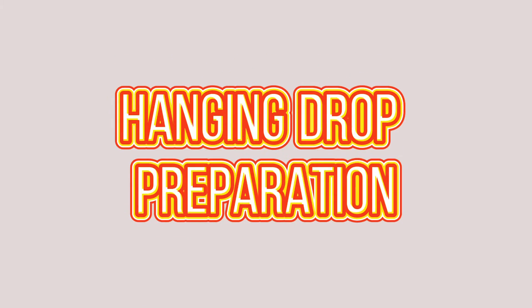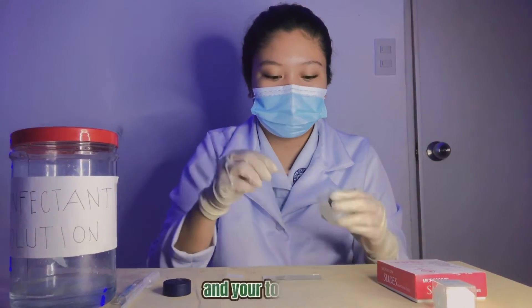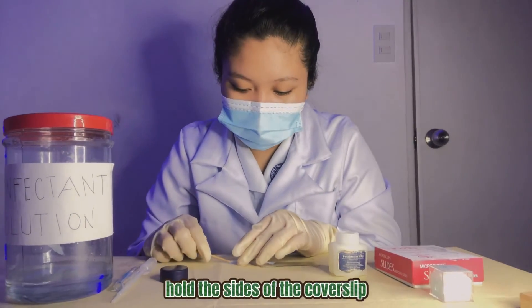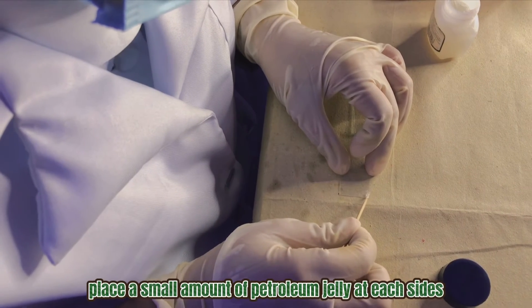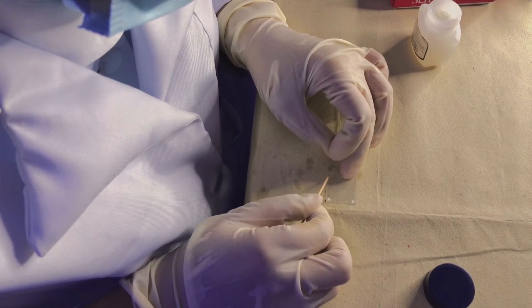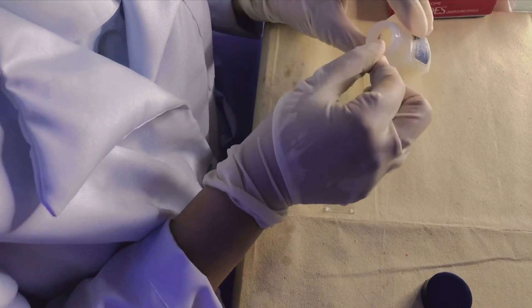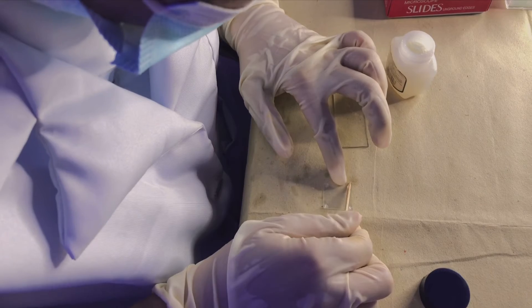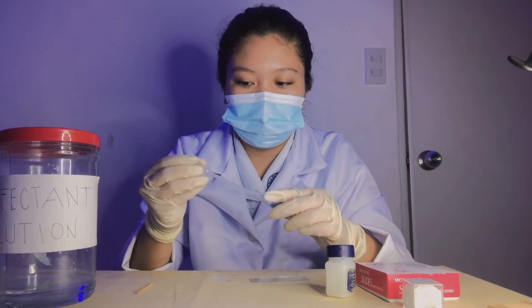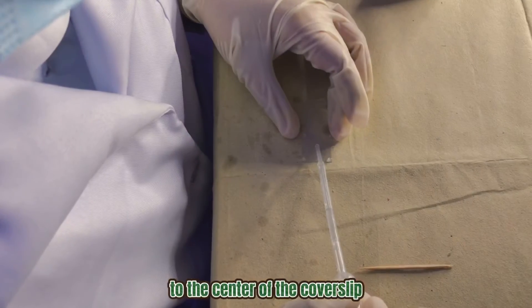The hanging drop preparation. Get the petroleum jelly and your toothpick. Hold the sides of the cover slip and place a small amount of petroleum jelly at each side. Put a small amount of water sample to the center of the cover slip.